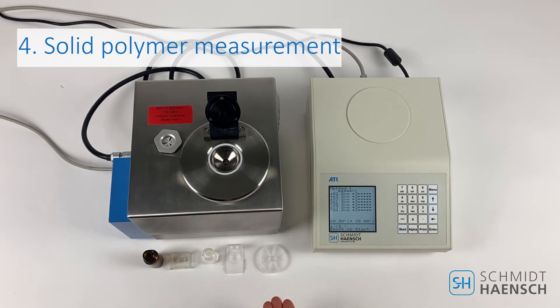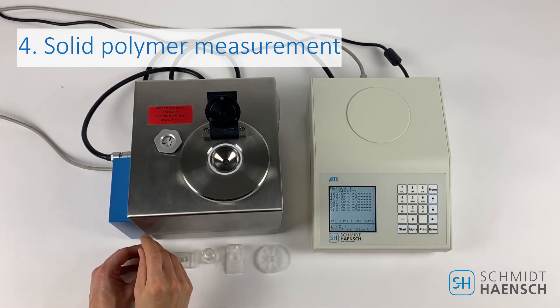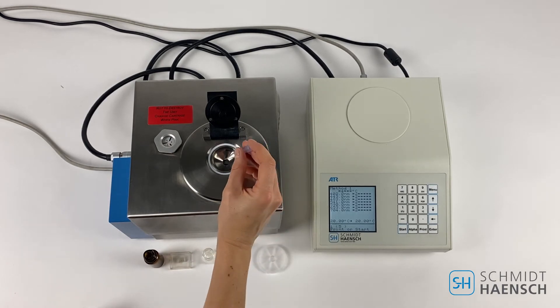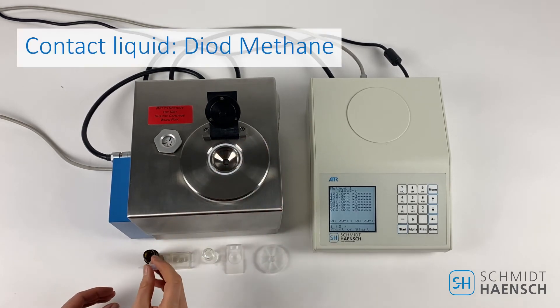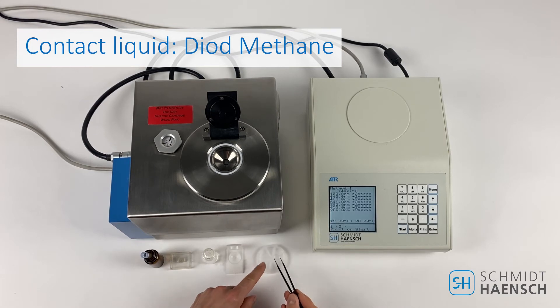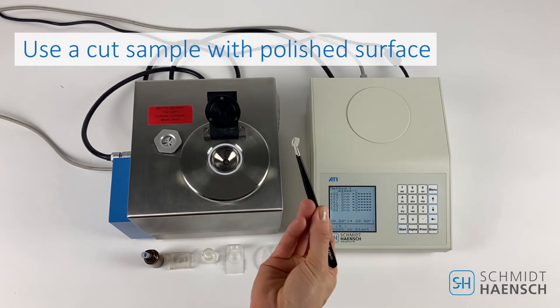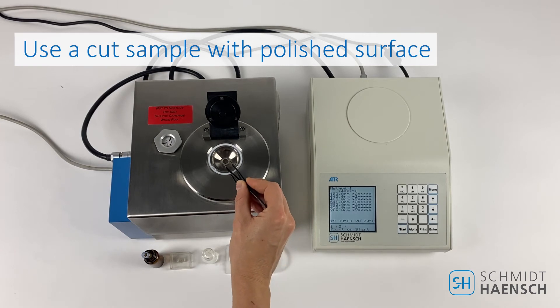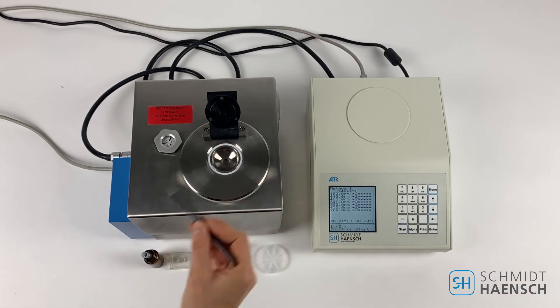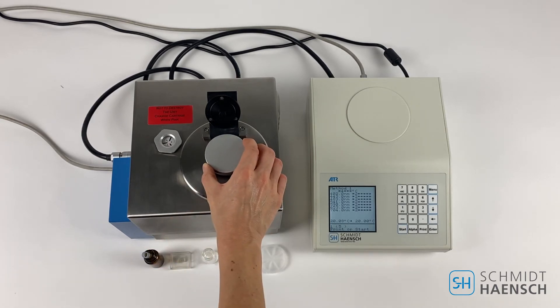We will show how to measure a solid polymer sample on our refractometer. Apply diode methane to contact the sample to the prism surface. Put a cut sample with a polished surface onto the measuring surface. Close the lid.